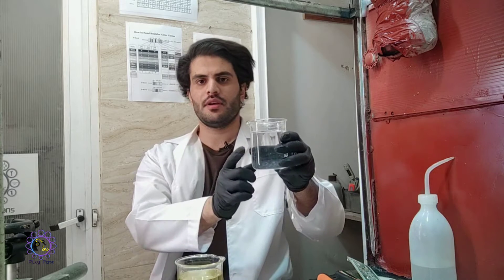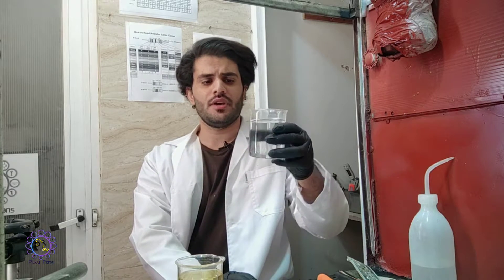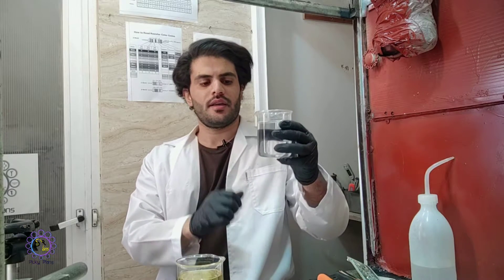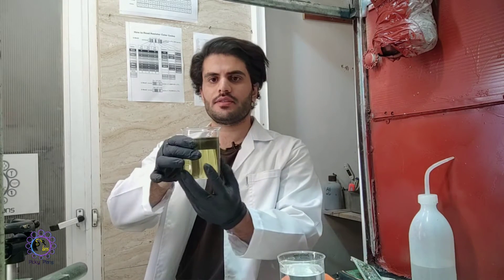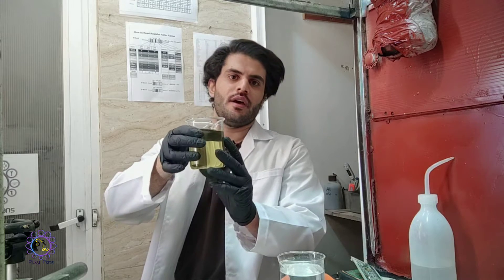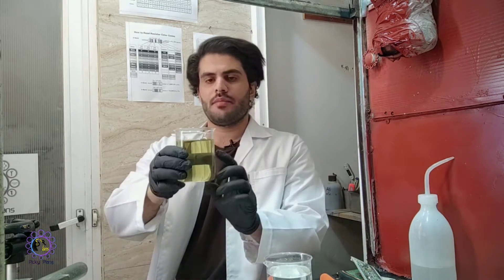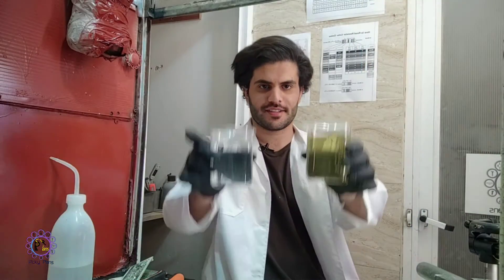I wanted to share my rejoicing with you guys. This first solution is based on urea nitrate, which I don't prefer because urea nitrate is a somewhat energetic material that I don't prefer to handle. This second solution is based on ammonium quaternary salt and nitric acid — this is the main solution I want to show you guys, so let's start.